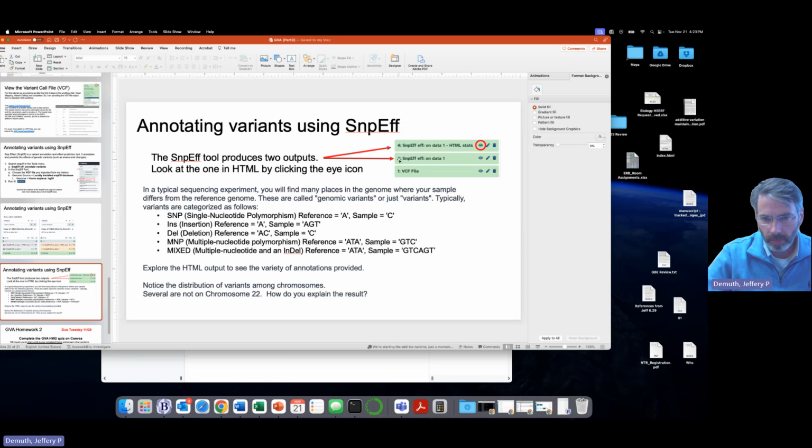You can ignore the job numbers here. I don't even remember. I must have erased a step. So if something doesn't run for some reason, it will turn red if there's an error. In that case, you can try to make the adjustment and then run the tool again until it completes successfully, in which case it will turn green.